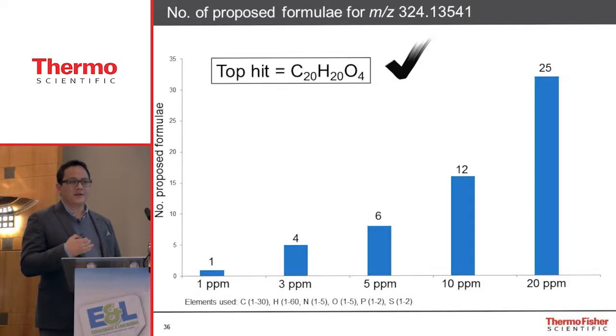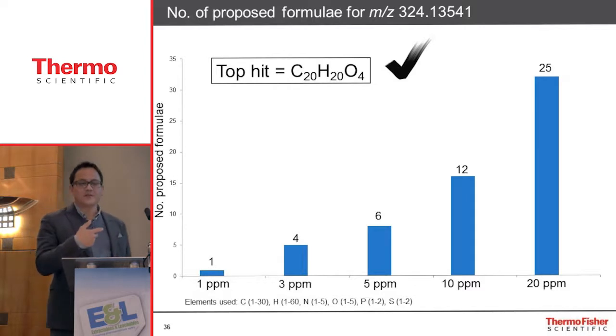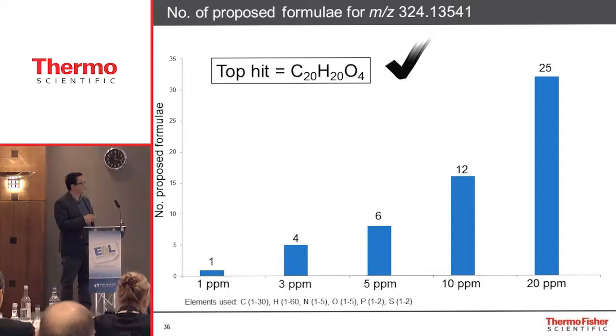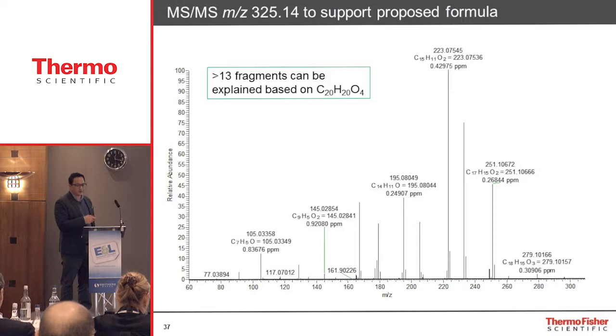I've gone on about the mass accuracy for a long time and probably repeatedly, but this is the real true value, because that mass accuracy on most instruments on the market would sit around 6 to maybe 10, some around 20 ppm on time of flight instrumentation down at these low molecular weights. In reality, at 1 ppm, the analysis of this unknown really would give you only one elemental composition. So within the period of a few seconds, you have a very high confidence elemental composition result to work with for an unknown that's not in your library.